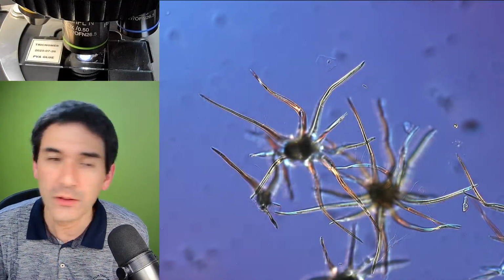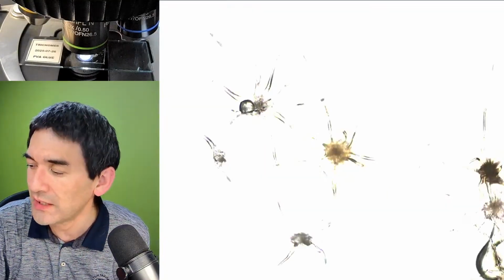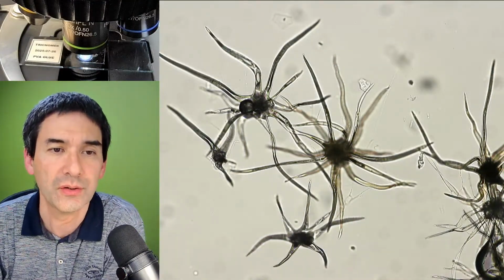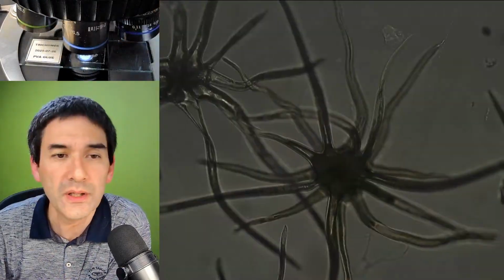In case you're new to the channel and wondering about the blue background, that's because of my optics. Normally, if you see them in bright field, this is how you would see them normally. So these are the natural colors here. And we go up, it is now 40 times.